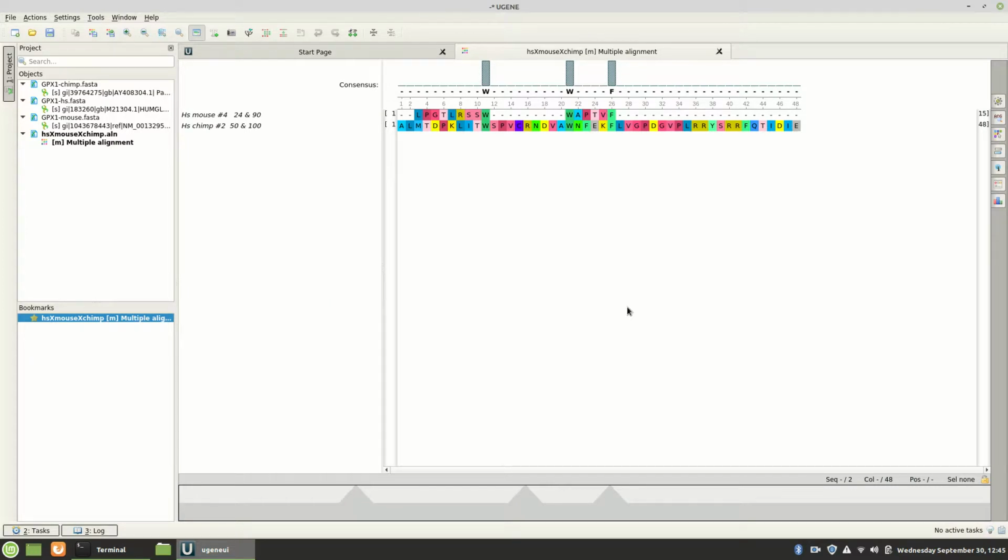Now you're going, that doesn't look like any alignment to me. Well, the funny thing, it isn't. These things are horrible at aligning. That's one of the reasons I wanted you to do this, is for you to align it. I see up here LPGT. So is there anything that looks like an L?